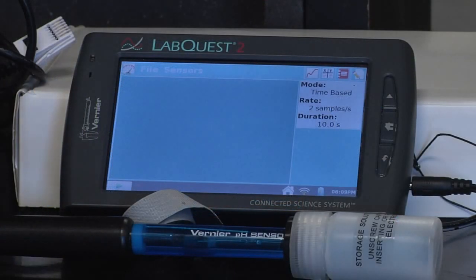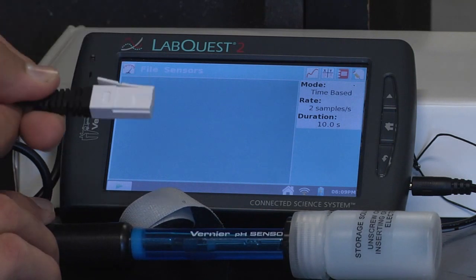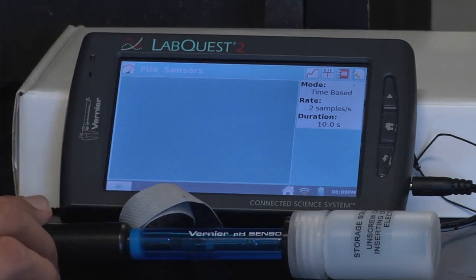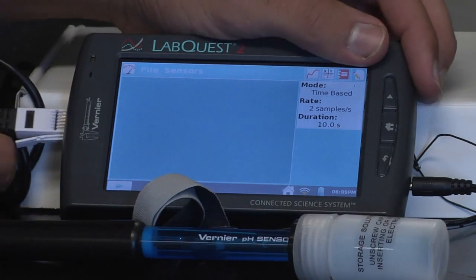So we're going to be using our pH probe with our LabQuest. Notice that this time it doesn't have a USB connection, so now we're going to have to plug it into one of these three ports on the side.